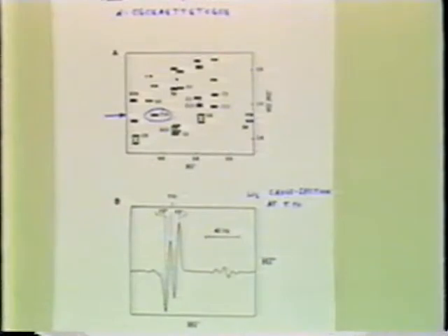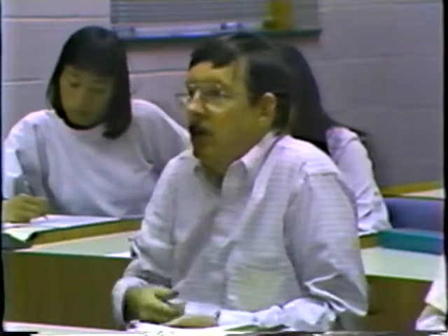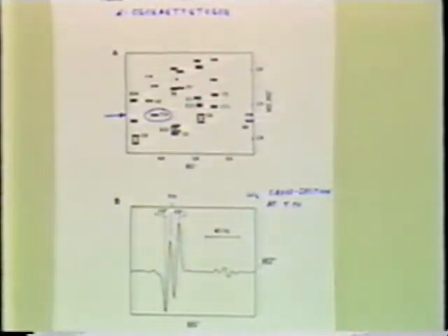Are they these 4? What's the total number of peaks down there? Okay, there are 4 peaks: 1, 2, 3, 4. These are because of the plus, minus, minus, plus character. So 4 big peaks, it's purely absorptive. And the other thing over there is another set of 4? This is a carryover wiggle from a nearby peak, and most probably this one. Carryover, that means it's on the tail or something?